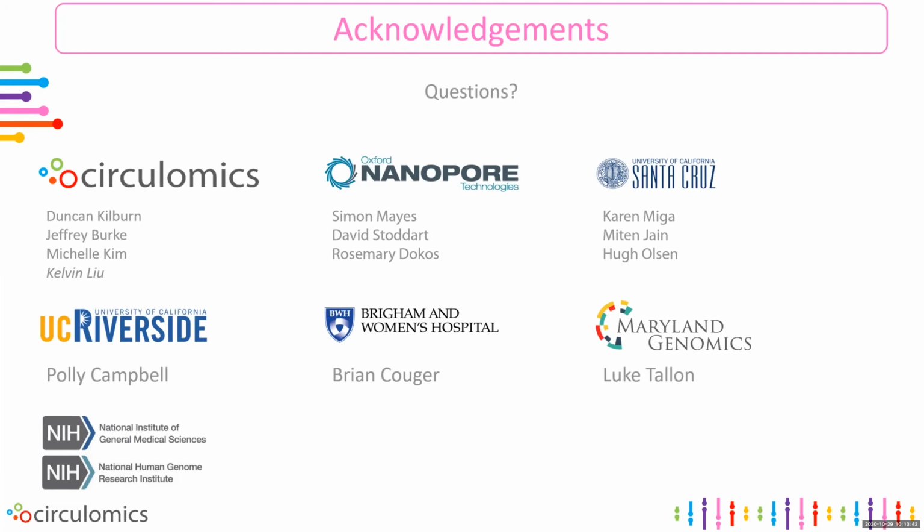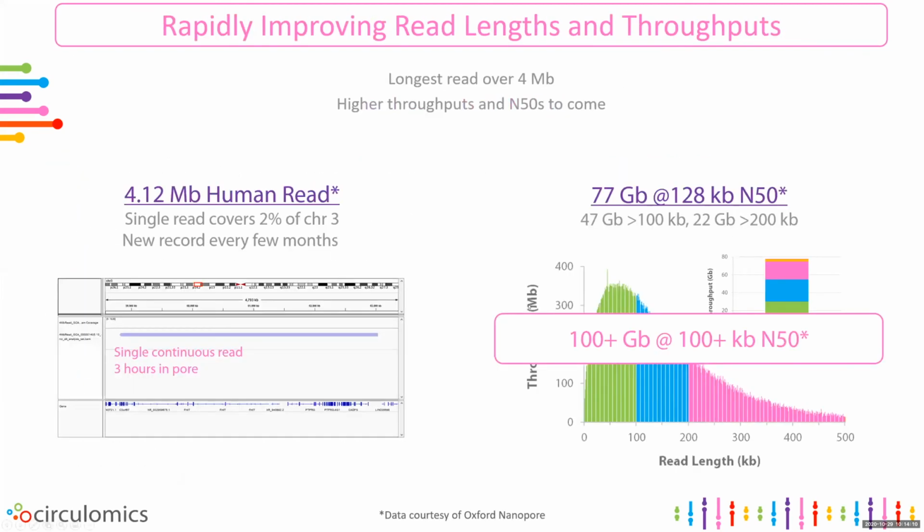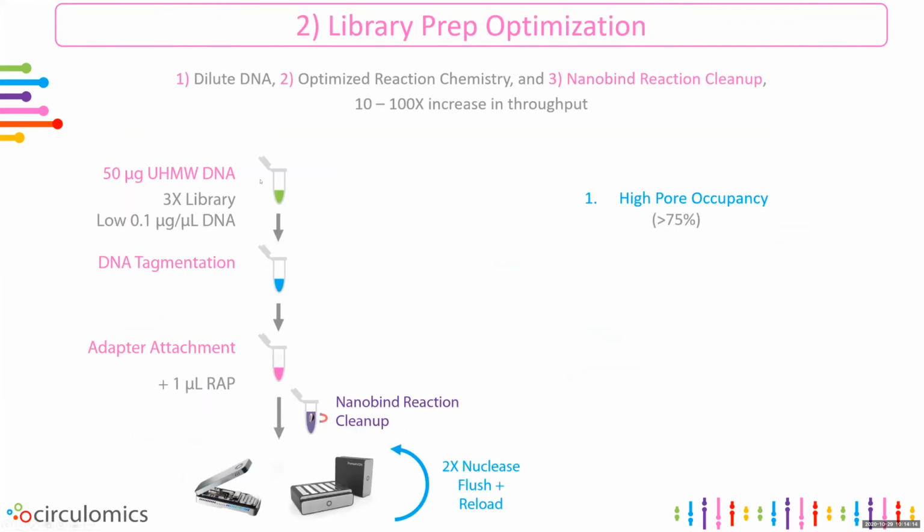All right, and then we have a question about what correlation you see between the size distribution and the loading amount. The loading amount should generally not affect the size distribution. That would mainly affect the amount of throughput that you get, but the amount of DNA going into the prep is quite important. For these preps, we're generally going in with about 50 micrograms of total DNA at the front end. If you put in less DNA, the reads will start to get shorter, but your throughput will start to go up. We've gone down to, let's say, 30 micrograms. It works fairly well with the 3x library. If you're willing to go down to a 1x library, that could be decreased again. That's one thing we'll be actively looking at with version 2 of the protocol, decreasing the input requirements.